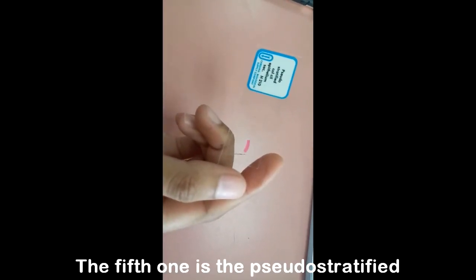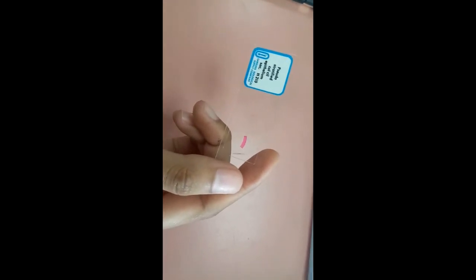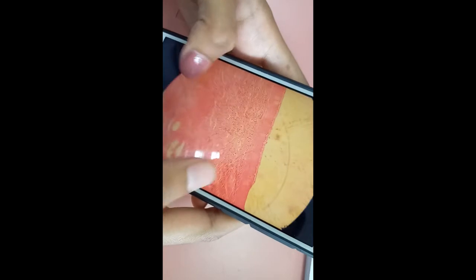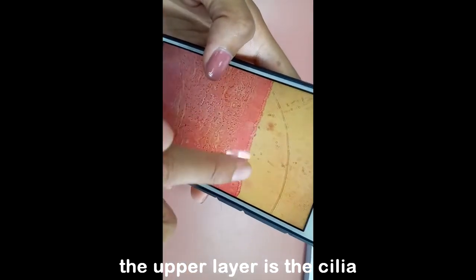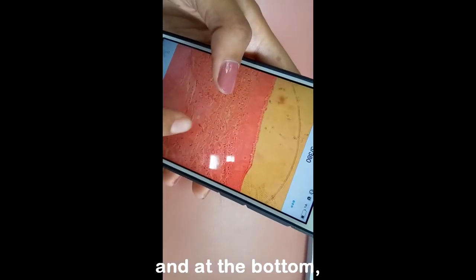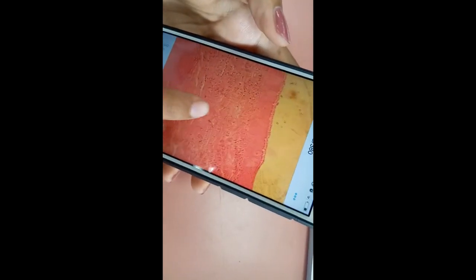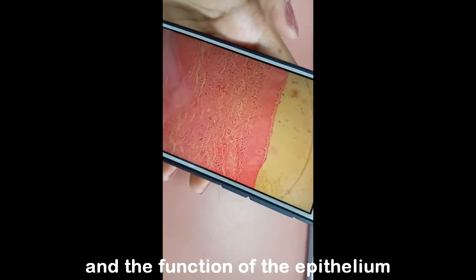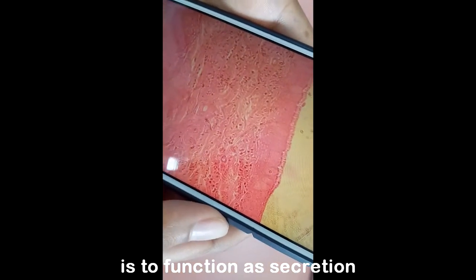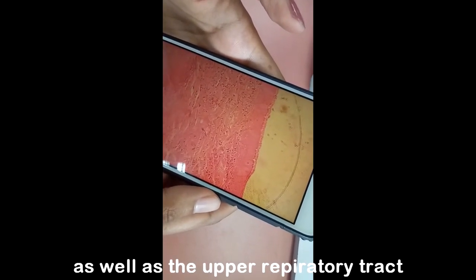The fifth one is the pseudostratified epithelium, which comprises only a single layer of cells. So this is the picture that we get after we observe it under the microscope. As you can see here, the upper layer is the cilia, and then we get the columnar cells here, and at the bottom we can see the basal cells here. The function of this epithelium is secretion and absorption. It can be found in the linings of the trachea as well as the upper respiratory tract.